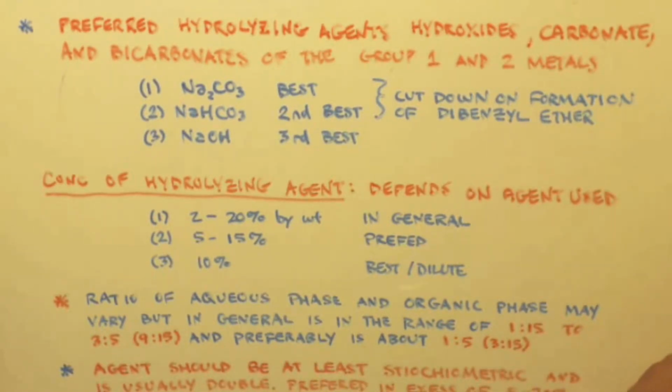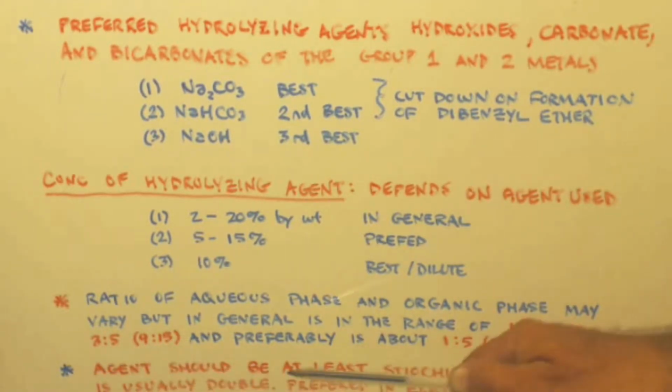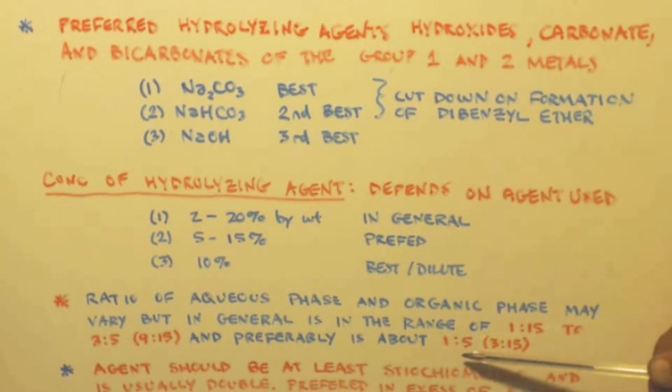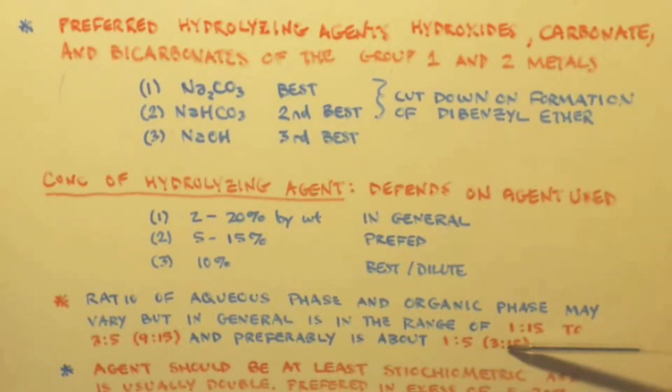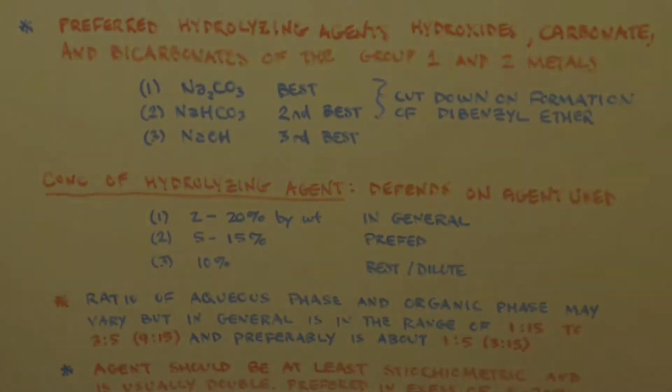What's the ratio of aqueous phase and organic phase? Again, it may vary, but in general, a range to get into would be 1 to 15, to 9 to 15, or 3 to 5. And preferably is about 1 to 5. And I put here 3 to 15, just so you can see. This is one in between 1 and 15 and 9 and 15, and the best is 3 to 15. I'm not sure about all that, but let's move on.